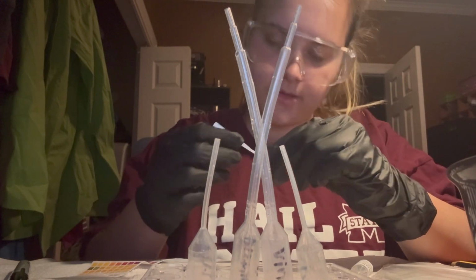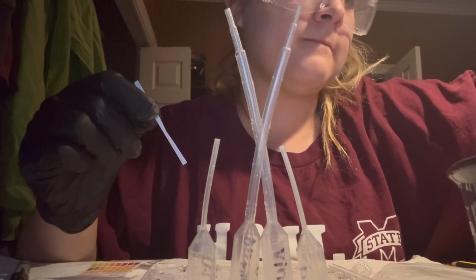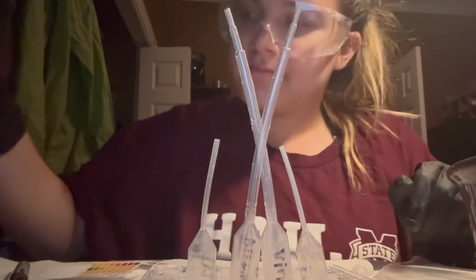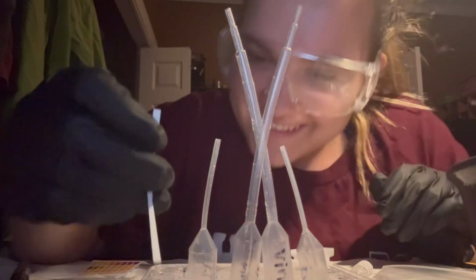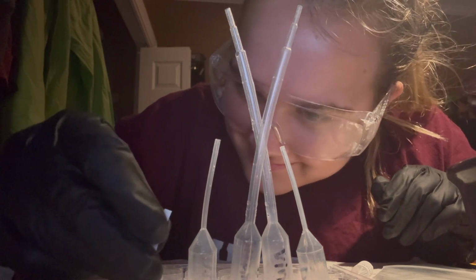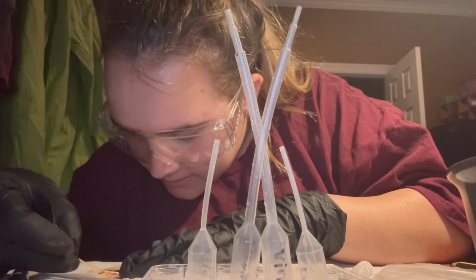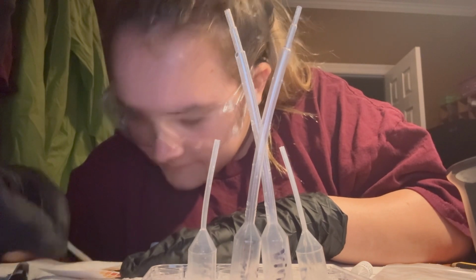So here's a new pH strip. Well, first we'll stir it a little bit. Okay, so the pH seems to have gone up a little bit. I'll probably say like 4.8.